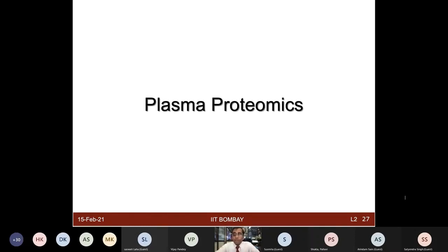But likewise, I'll show you some more sample types and how to do good protein sample preparation, protein extraction from other biological samples as well. For instance, plasma sample, for example, cerebrospinal fluid, nasopharyngeal swab, or other types of samples as well. So I'll cover a couple more of these sample types, so that you are more exposed to thinking about what the inherent challenges involved are, and how creatively you can come up with your own workflow of doing the best protein extraction method for proteomics application.